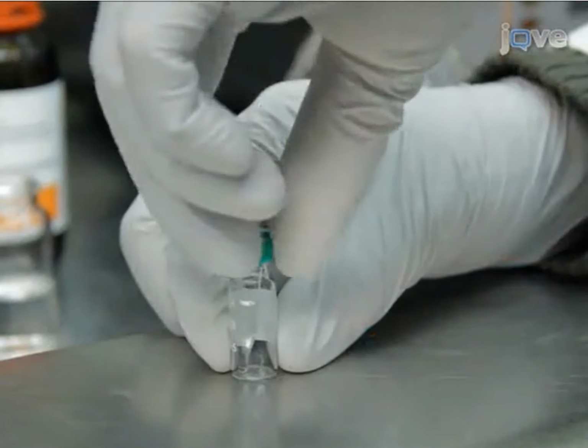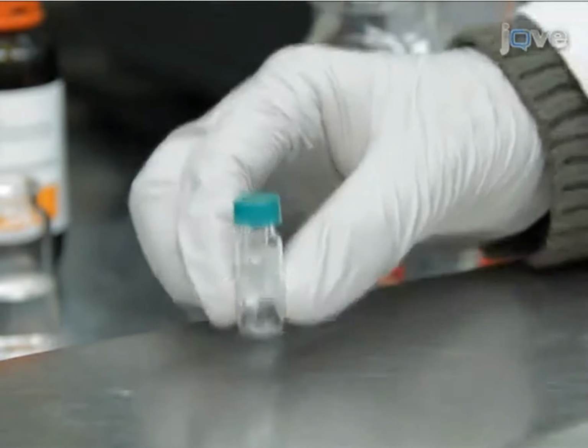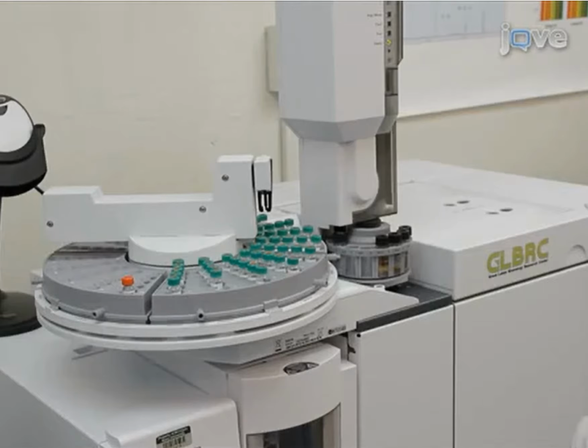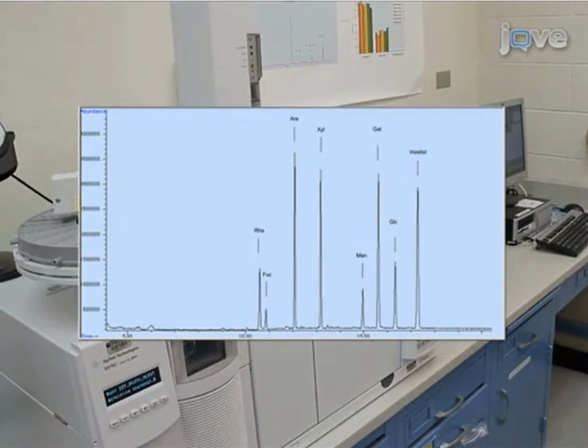The GC vial can be stored at 4 degrees Celsius if the GCMS analysis does not immediately proceed. Inject the samples into a gas chromatographer that is equipped with a quadrupole mass spectrometer. For column and details of the run, please consult the accompanying written protocol.